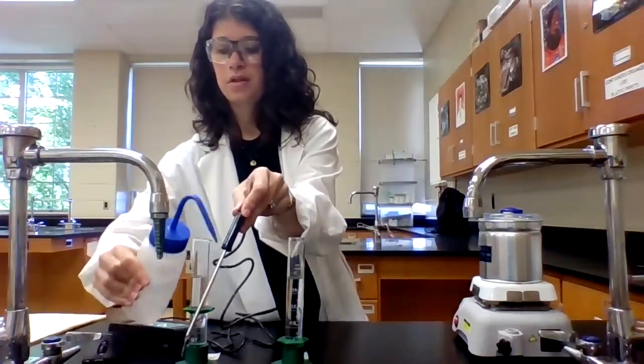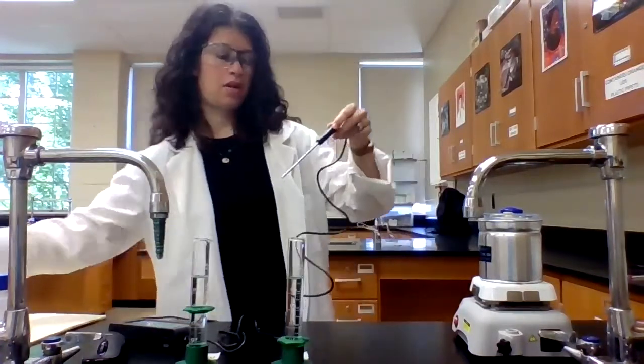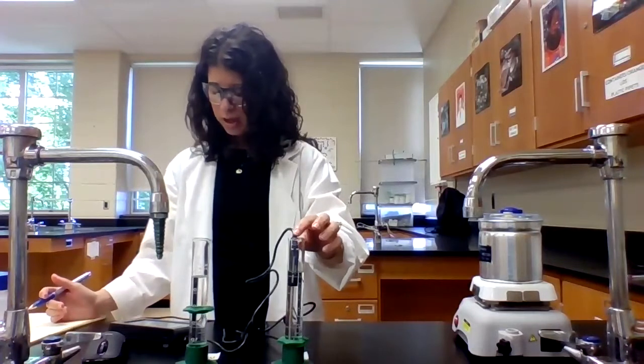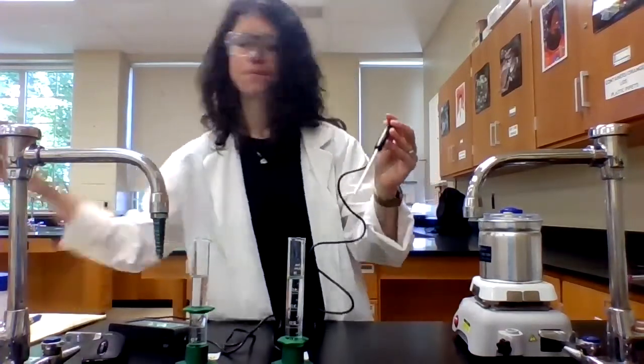I want to give this a quick rinse. And then I also need to measure the initial temperature of the hydrochloric acid. If they are not at the same temperature, then I will take an average of the two. But I need to know the initial temperature so that I can then figure out how much the temperature has changed during the reaction. And so they are a little bit different. The hydrochloric acid is reading 22.3 degrees Celsius. It's pretty close, but slightly different. Okay, so we're going to give that a little rinse as well.